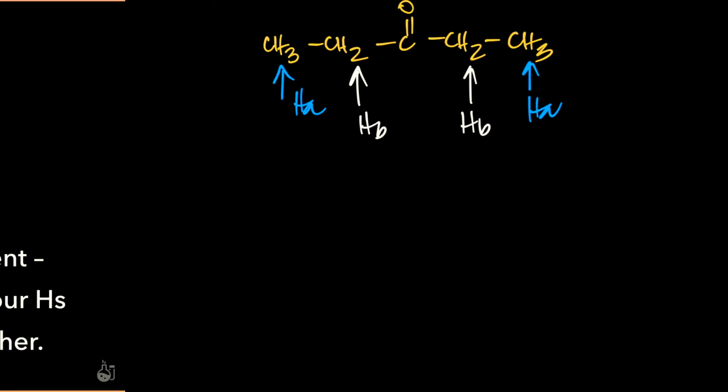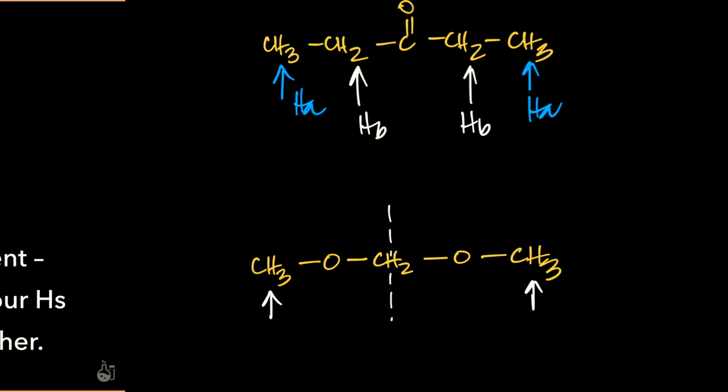Now somebody had asked me a question earlier, and I'll answer it. What would happen if you have CH3OCH2OCH3? Take a look at this. You can even figure out the answer yourself. How many environments must this have? 2 environments, because there's a line of symmetry, which makes this CH3 and this CH3 identical. So they will be called HAs, and this would be your HB. So only 2 environments, and the height would be 6:2.